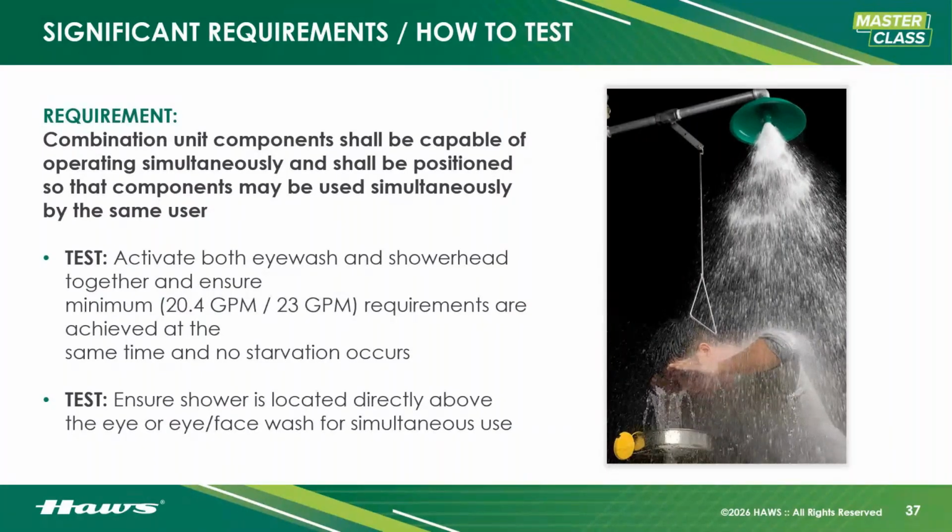And if you have a brand or you ordered your equipment on Wish or Temu, you definitely want to check because they may not be utilizing flow controls correctly and creating back pressure that both supply the eye face wash and the shower simultaneously. You will see starvation, and it is a very sneaky piece of compliance because many people skip testing the shower because it's a mess. And sometimes if you're not good at it and you're nervous about it, you might make a mess. So sometimes they'll skip it.